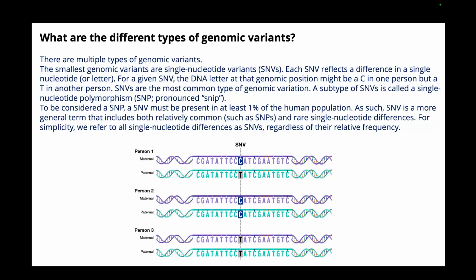If you made a reference genome based on an African sample, then those variants would not come up, because most African people will have a similar kind of SNP structure. So the variants are always defined in terms of the reference genome, and you have to take it with a pinch of salt.